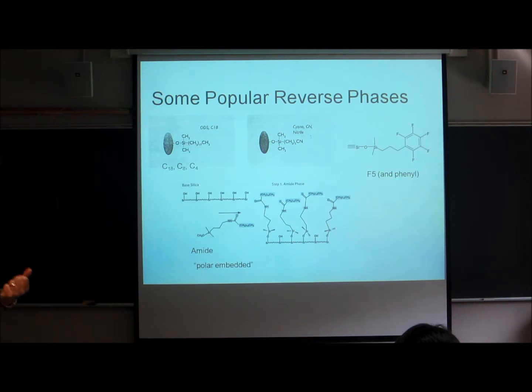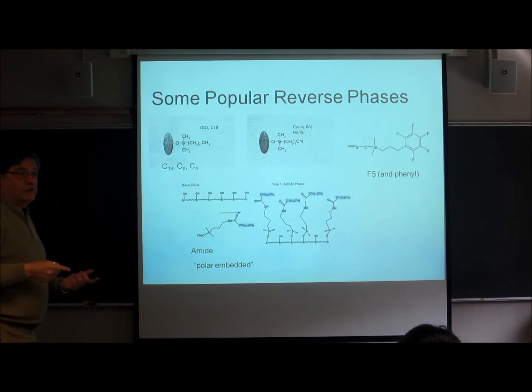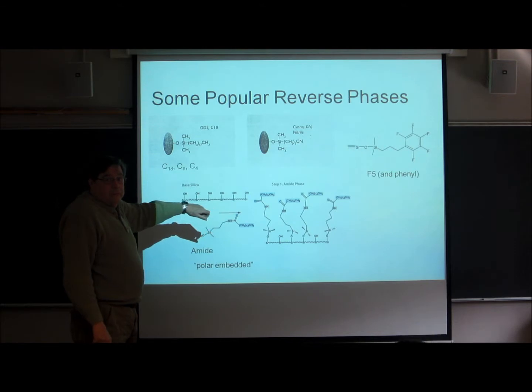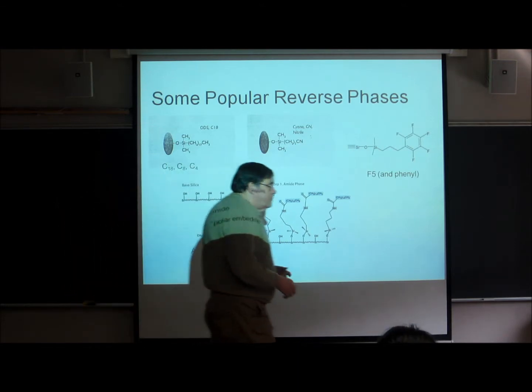But what else? What do you suppose the effect of the long chain sticking out is? To modify that behavior and give you what we call a mixed mode of selection. Both oiliness and charge are involved in this. And once again, this is a kind of compound that you might look for if you had a particular separation that was not performing very well with the C18. Polar embedded.